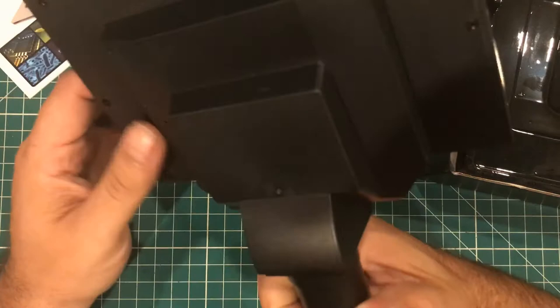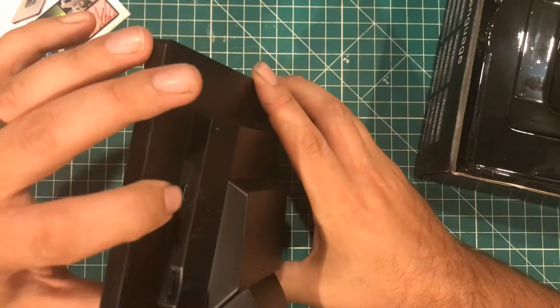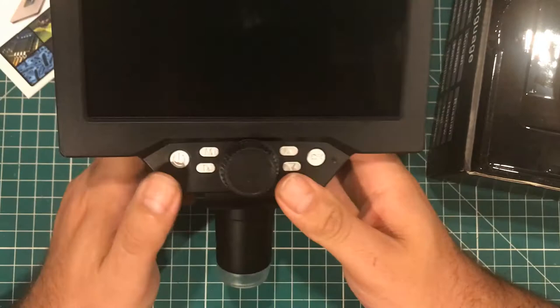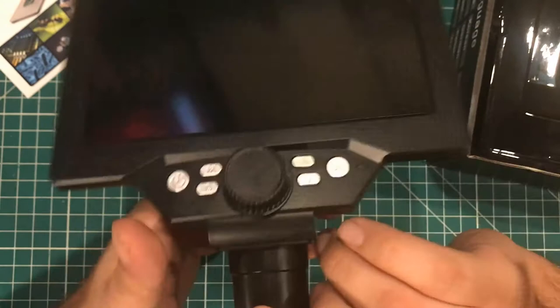So we've got the LCD screen. There is micro USB on the side, micro SD here, and the LED brightness knob. You've got the LCD screen, your camera, some power buttons — macro, digital — we'll figure out what all that stuff means. Overall seems pretty nice. There's a little LED ring around it. Doesn't weigh too much, feels like a reasonable weight.